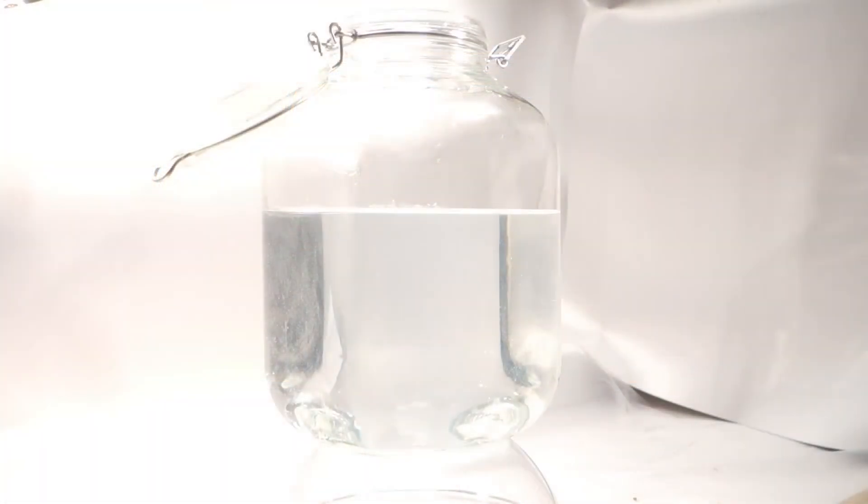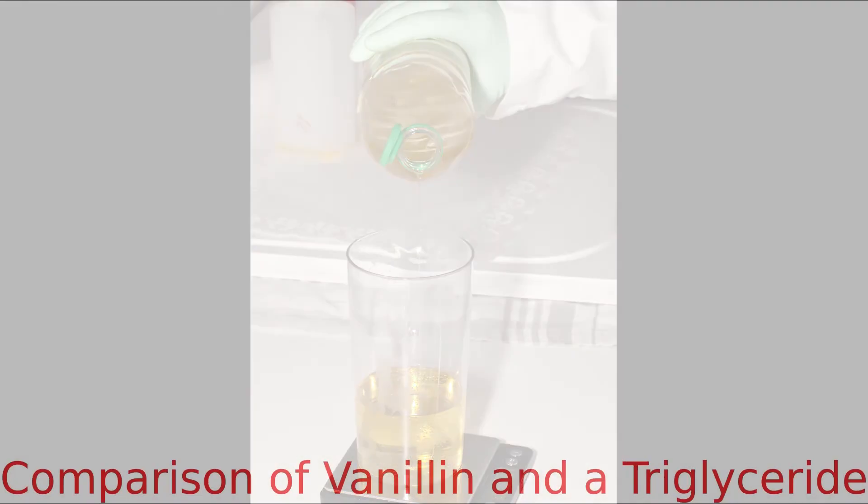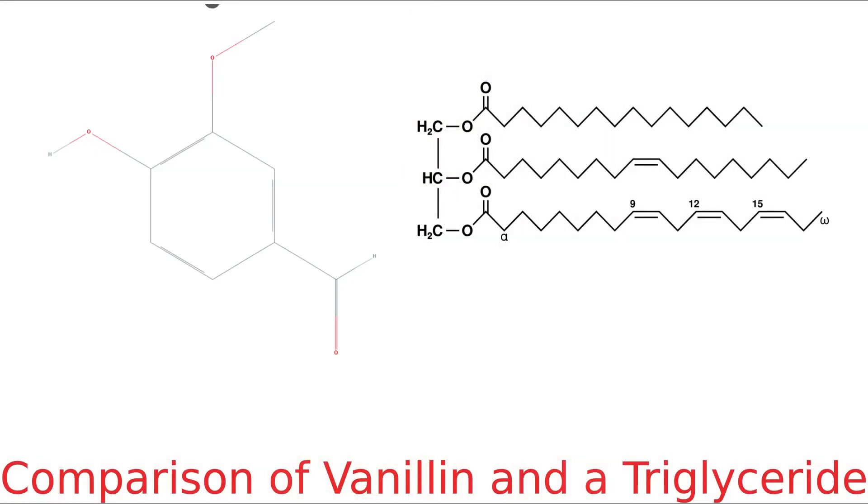The final product that you'll be extracting is a lot of oil, primarily vegetable oils depending on what you're trying to extract from, but largely vegetable oils. These are different to your essential oil in that they are often very large, made up triglycerides, and aren't very aromatic. There will be some aroma to them as they're a chemical and they do react with the olfactory bulb, but for the most part they are non-volatile. That means they don't separate from the rest of the mixture. Because they don't readily separate out, they remain in there. And this can interfere somewhat with what you're trying to make, and one reason to consider distilling your essential oils later on. The essential oils themselves are largely made from the aromatic compounds, and these do separate off as they're volatile.